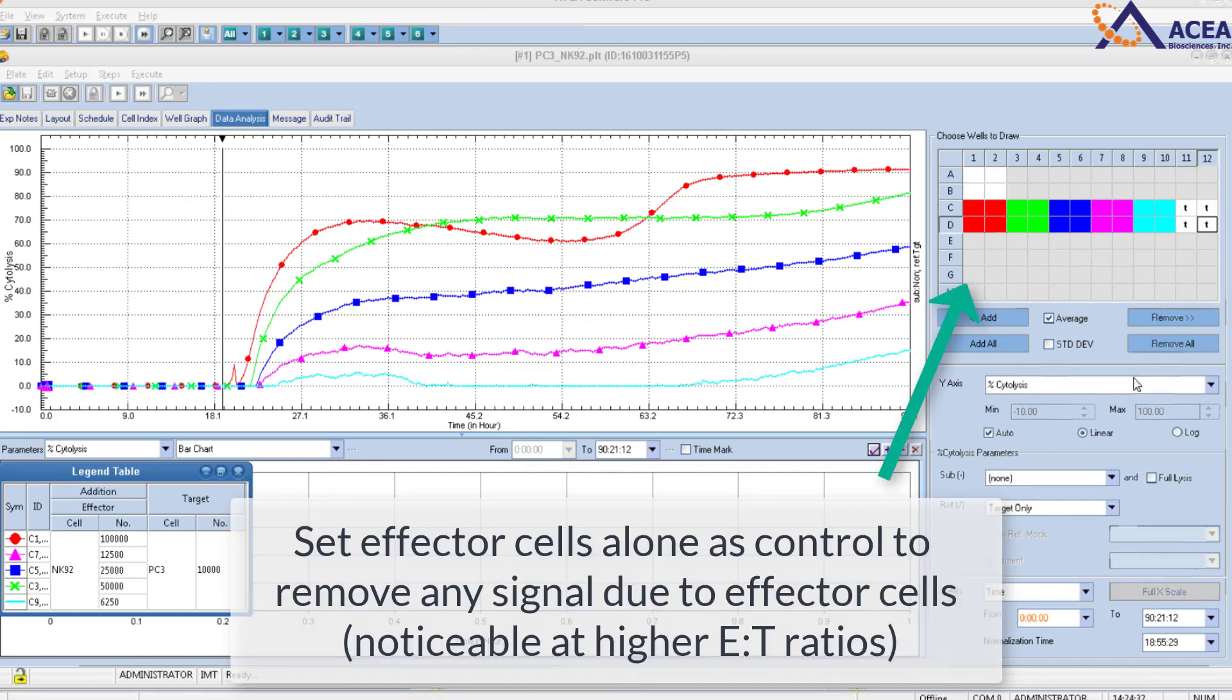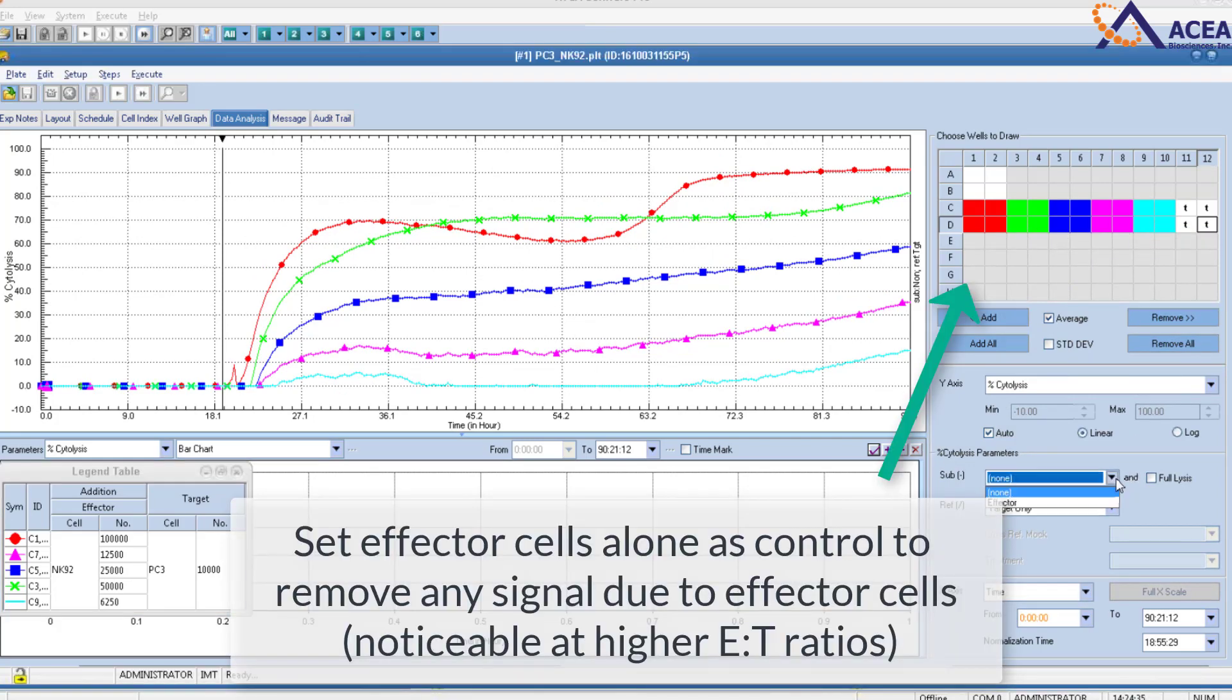Effector cells alone are set as a control to remove any signal due to effector cells, which may be noticeable at higher E to T ratios.